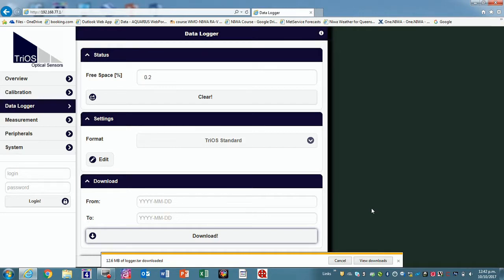What people use it for is fingerprinting water, so to say. And if you get anomalies, you might be able to see some strong organic substance coming through from some contamination somewhere. Okay, so it's not showing us the deterioration of the lamp itself. No. The lamp is unlike the deuterium lamp I described earlier. This lamp is a xenon flash lamp. It either works or not. So you don't see anything on that. And it'd be really difficult to hand calculate the values from just the raw absorption spectra. But that said, if you have them, you might store them.